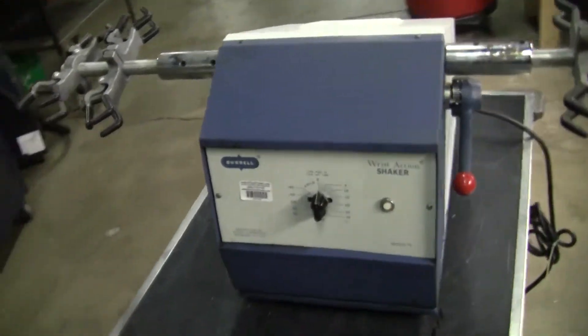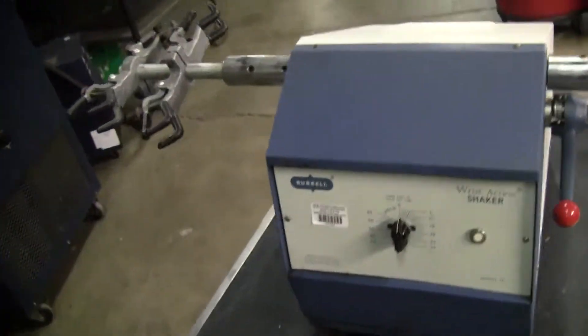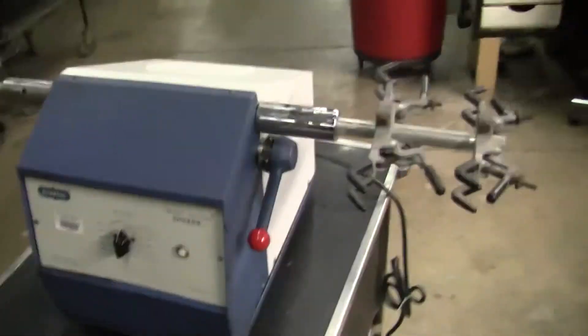Hi, this is Michael Natow from Hi-Tech Trader. Today we're looking at the wrist action shaker made by Burel. This is a classic wrist action shaker.